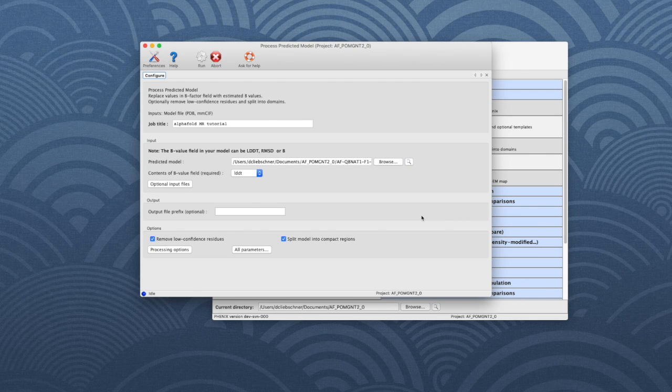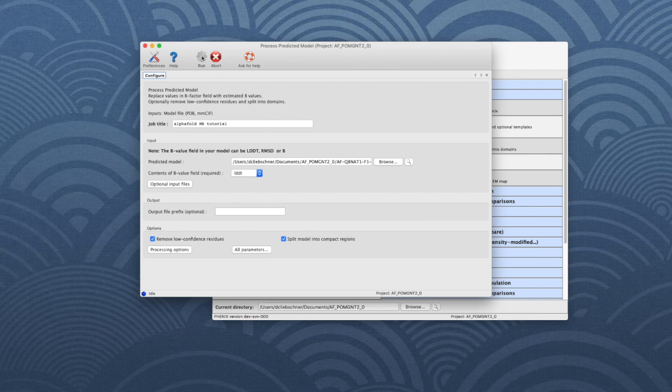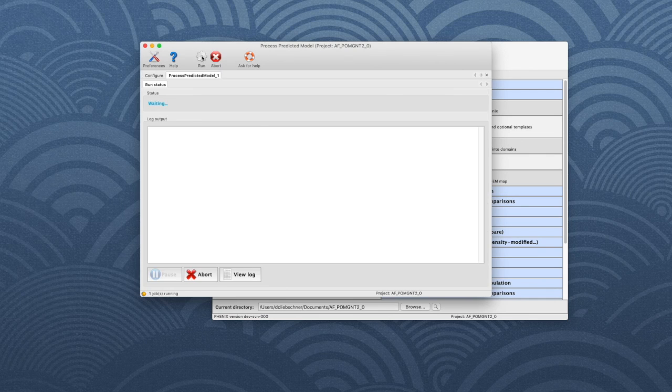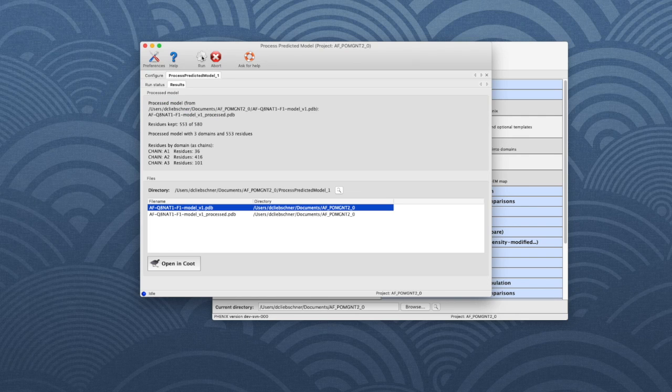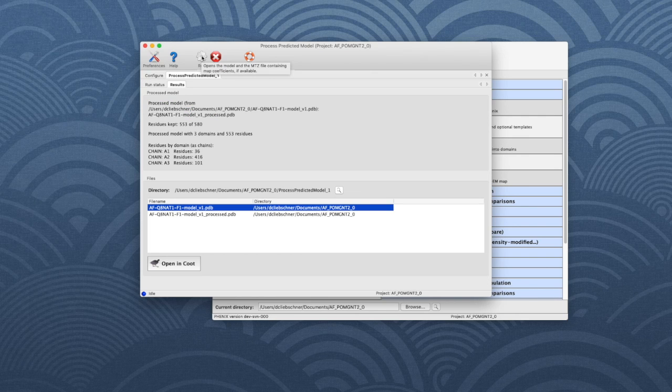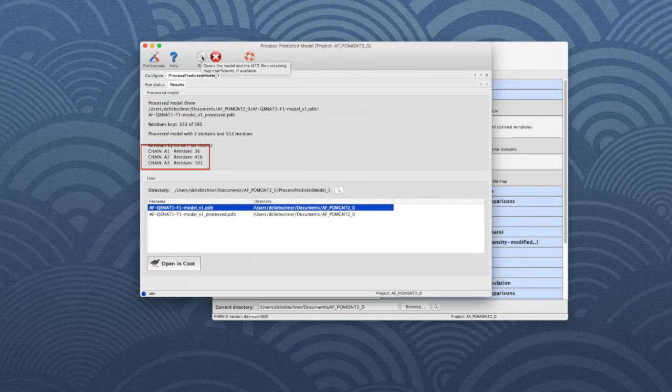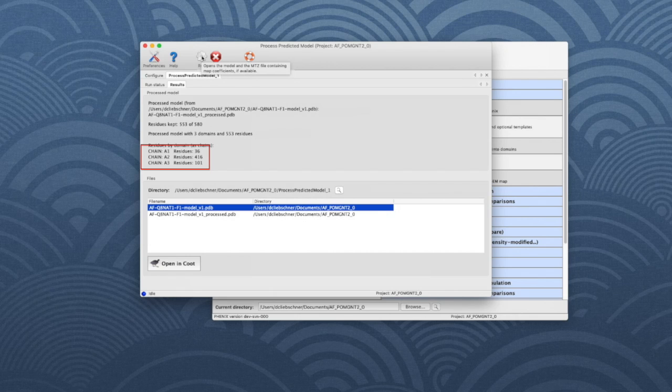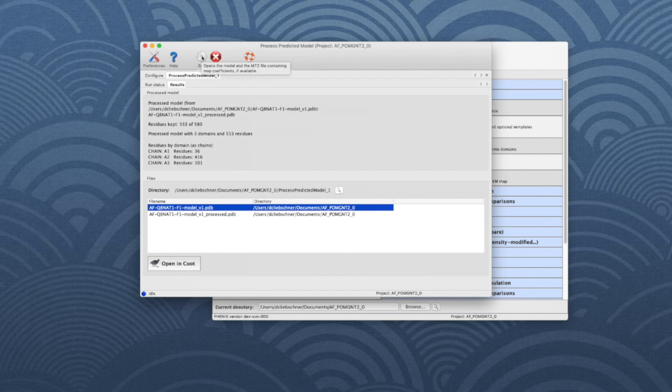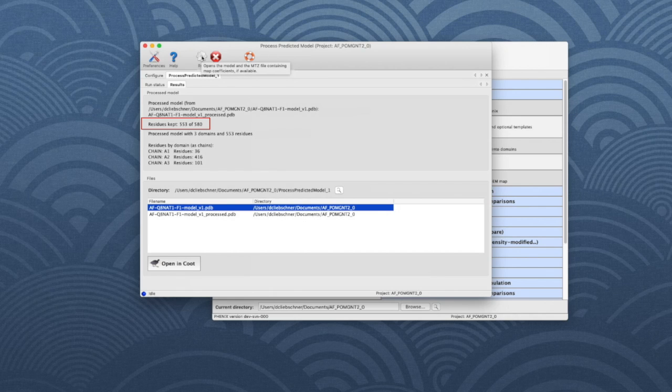We leave all other parameters at their defaults, then click Run to start the program. Once finished, the program has separated the AlphaFold model into three chains: A1, A2, and A3. We will ignore chain A1, the long helical domain, as it corresponds to a membrane anchor helix that was left out of the soluble construct made for crystallization. Note that the program also purged some low-confidence residues from the model and indicates the number of residues in each domain.